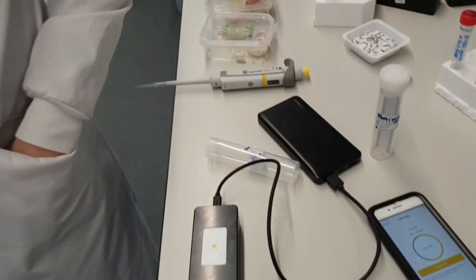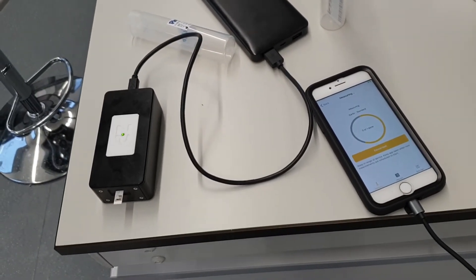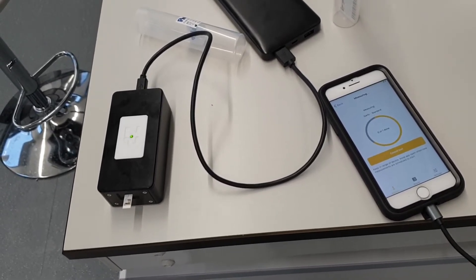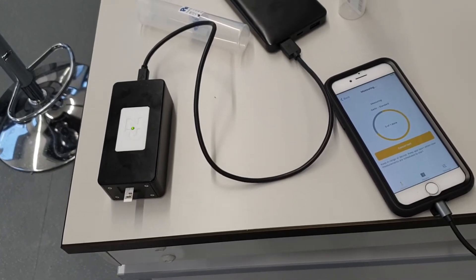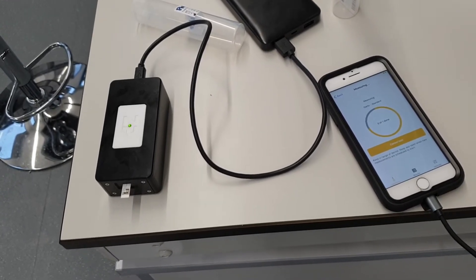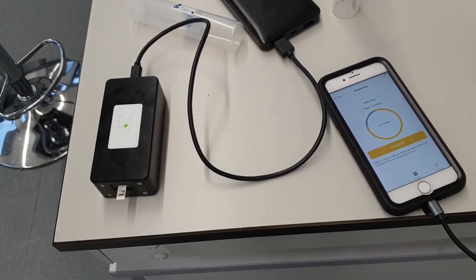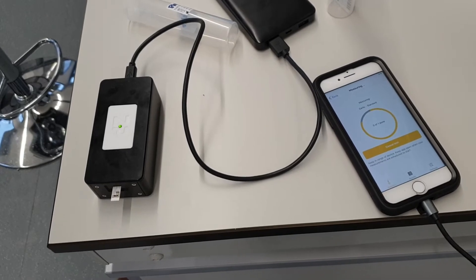Going back to the app itself, we're about 40 seconds into it, so it keeps tracking around. At the end we'll get a score, and that score will be indicative of the pungency of the garlic itself. We're about 10 seconds from the end now.